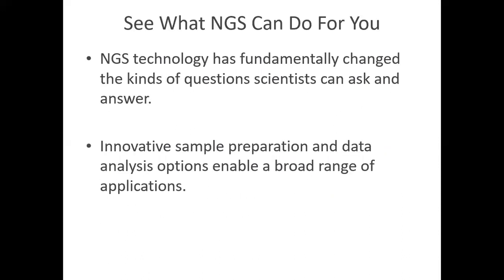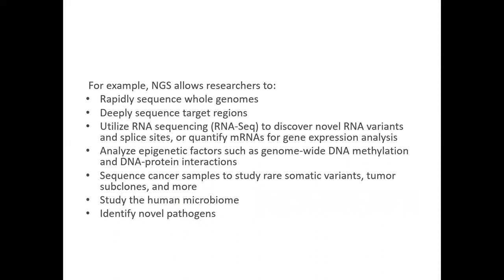So what can we do with NGS? NGS technology has fundamentally changed the kind of questions scientists can ask and answer. The innovative sample preparation and data analysis options enable a broad range of applications. For what purpose can we use NGS? We can rapidly sequence the whole genome, right? For example, we can sequence the whole human genome at a time. That is possible with NGS.